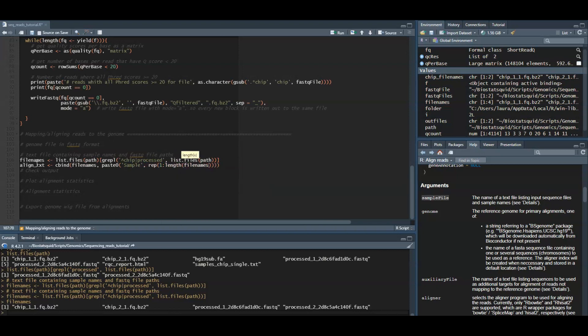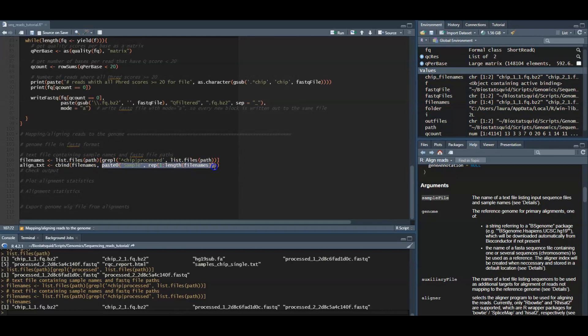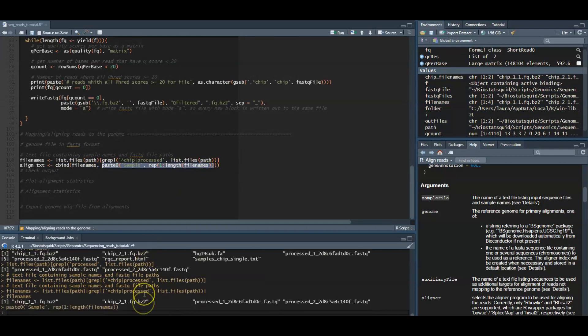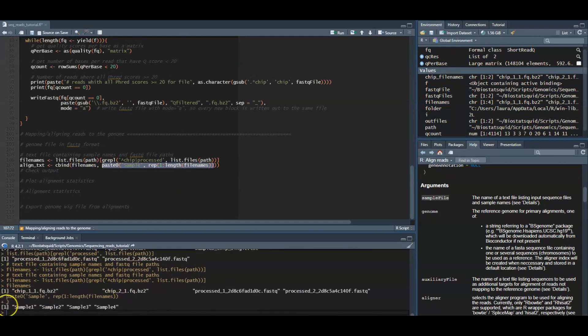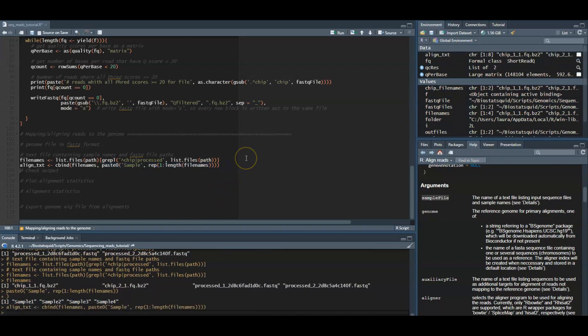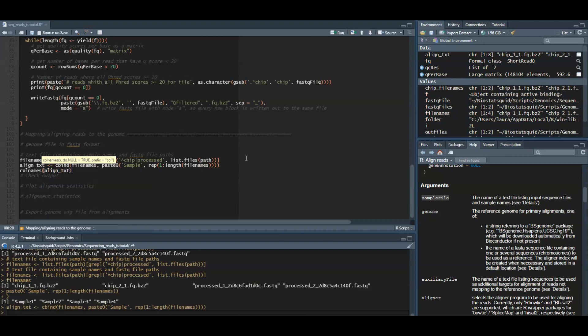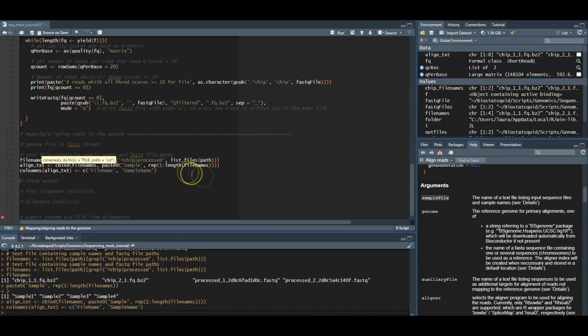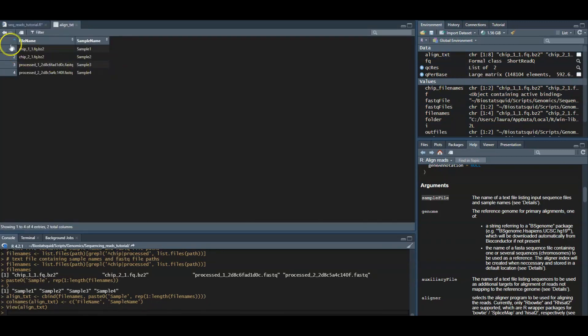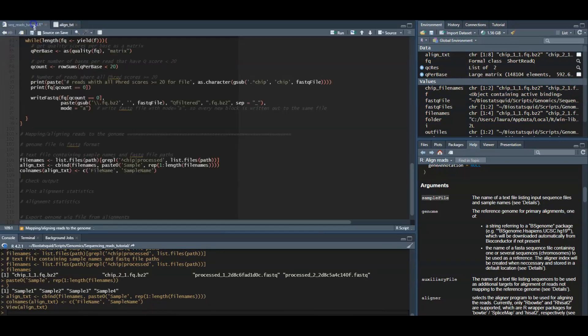Again, this is up to you, you can change your sample names to something a bit more informative. For example, chip one, chip two, processed one, process two, or whatever you'd like. We will use the cbind function to create a data frame which we assigned to the align text object. And now we just add column names to this data frame. As you can see, now we have the two column names, file name and sample name, and our data.